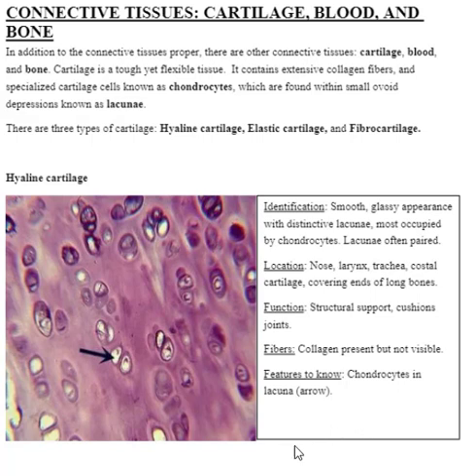But what's really interesting about cartilage is you have the cells that are laying down the cartilage, but they have a little bit of a problem because they're walling themselves off. It's kind of like painting yourself into a corner. So what these cells have to do is leave a little lake in order to have fluid around them, to get nutrients in, and to get rid of waste. So we call the lake a lacuna. A lacuna. So there's the little lake, and there's the cell growing in there.